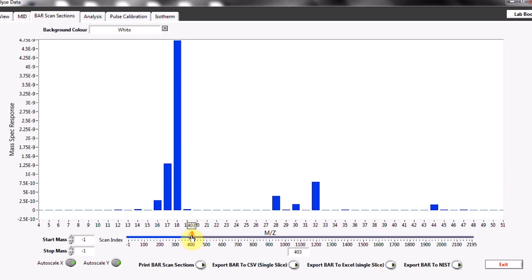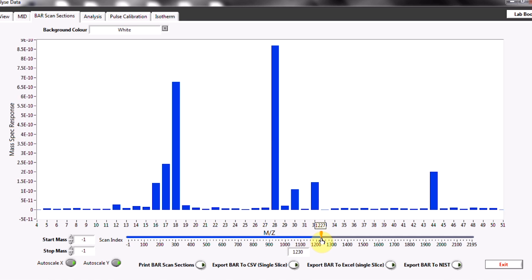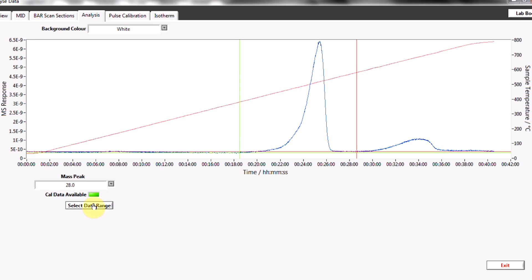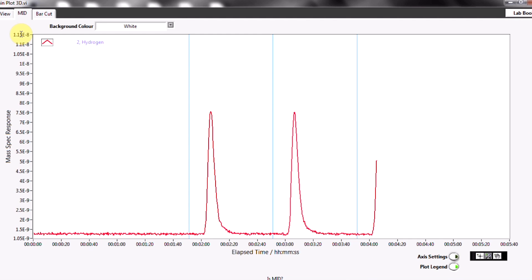With the measurement completed, the data can then be analyzed using the included data processing features. These include peak integration and deconvolution, metal surface area and dispersion calculations, uptake and adsorption isotherms. Data can also be easily exported to any other data analysis package such as Excel or Origin.